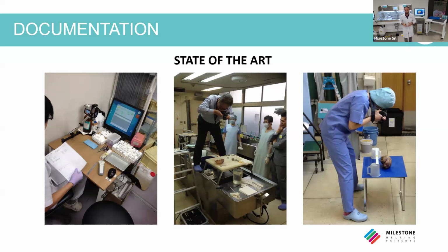The second two images probably don't need an explanation, but as you can see, there is a pathologist balancing somehow, managing to take a picture. First of all, this is not safe for him because he can fall, and it's not safe for the sample because it can hurt the table and then fail or be lost. Again, it's not a standardized picture or video.